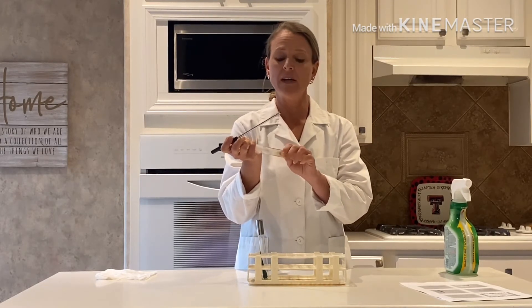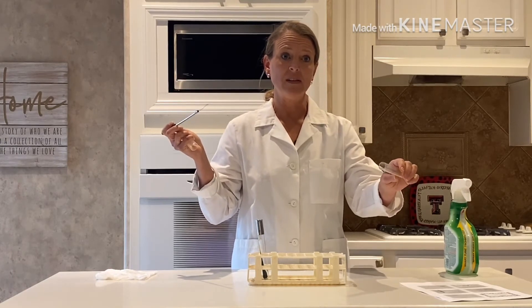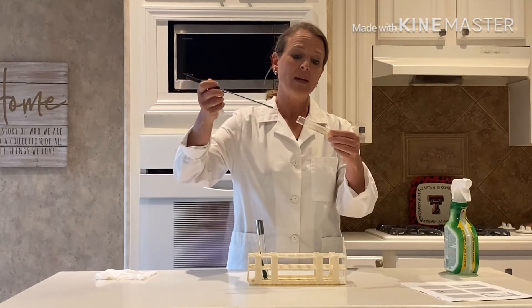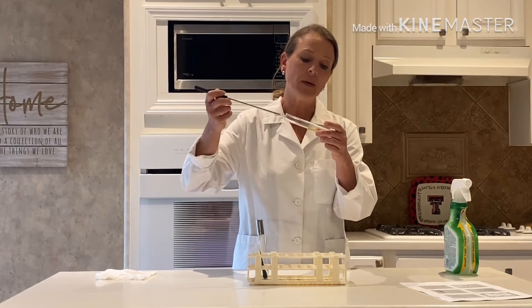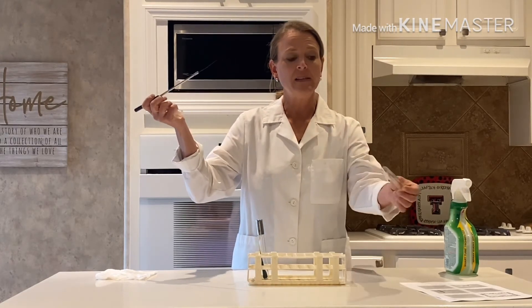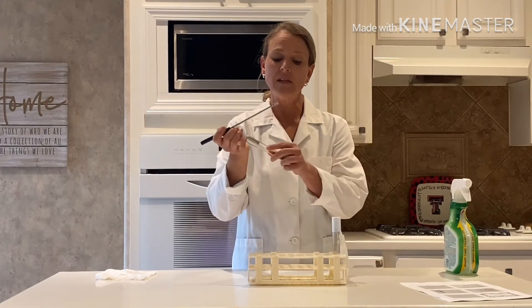I'm going to aseptically remove the lid — I'm not going to place it down on the table, I'm using my pinky. Once I remove the lid I'm going to pass the test tube through the flame of the Bunsen burner to sterilize the outside part of the test tube. I'm going to take my loop and go in at an angle so that I don't damage the agar, but rather just gently scrape off a little bit of bacteria from the surface. All you need is a little bit of bacteria. Then I'm going to pass my tube through the flame one more time to sterilize it, and transfer the bacteria on my loop into the slant.